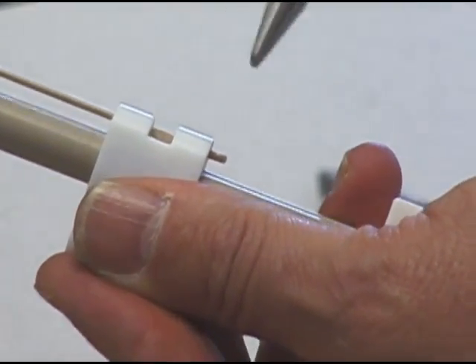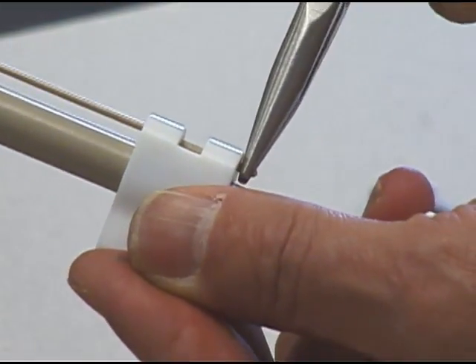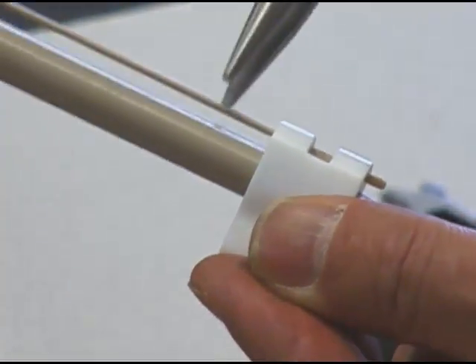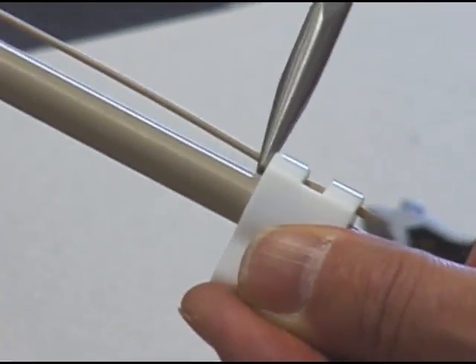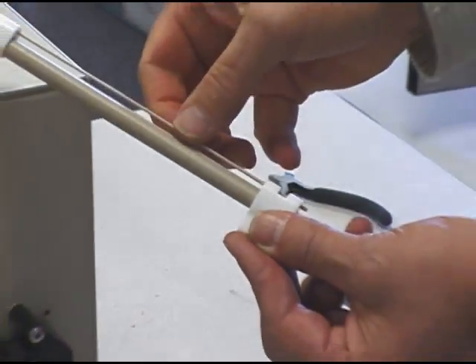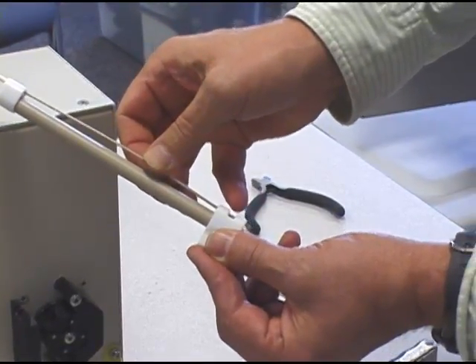As added holding power, you could also crimp the bottom and also crimp the top — that will hold that peak tubing in place. You should have very little play at this point on the peak tubing going through this slider.